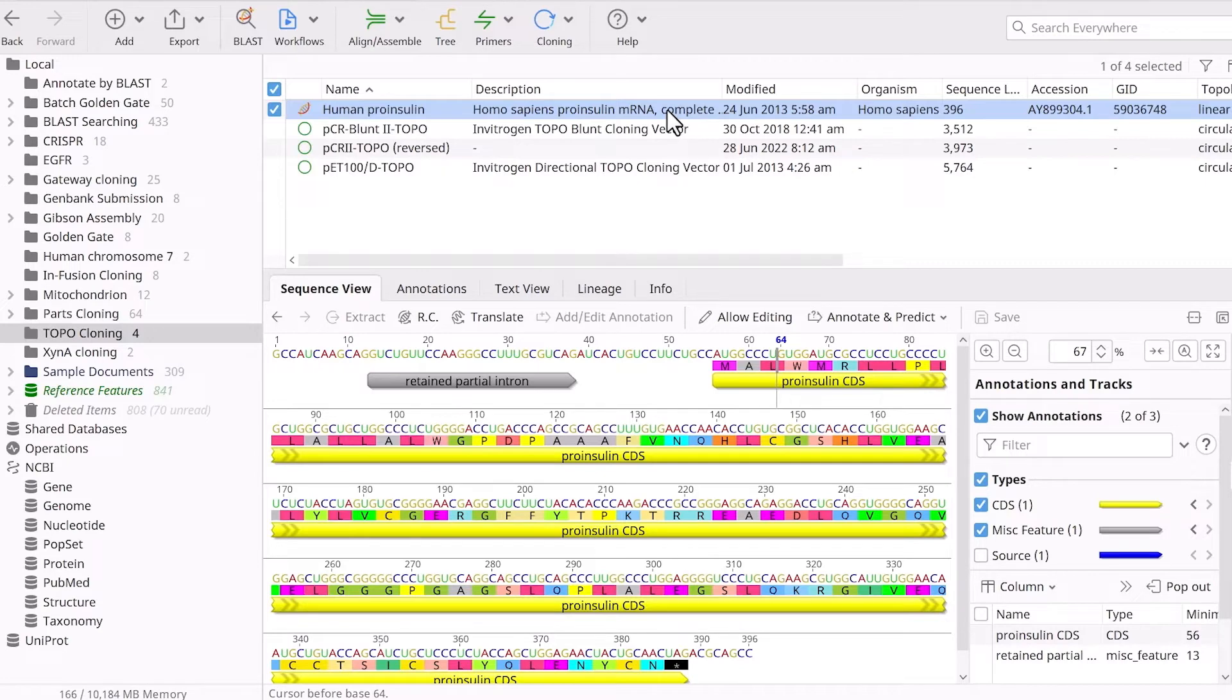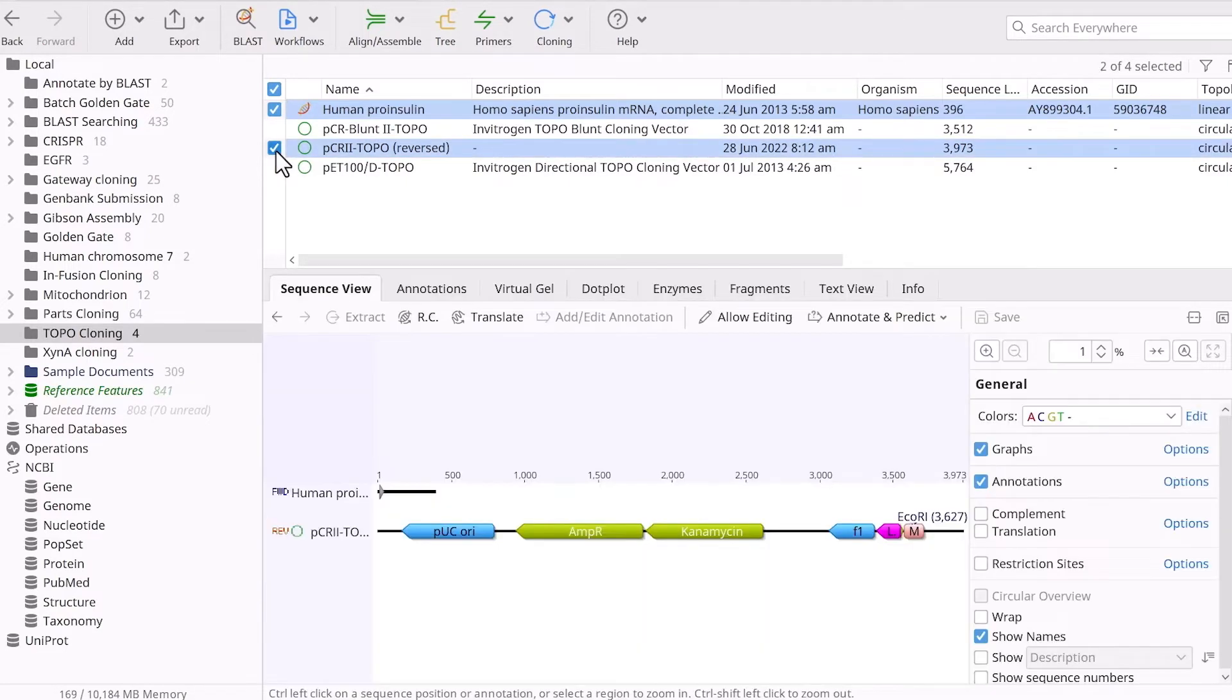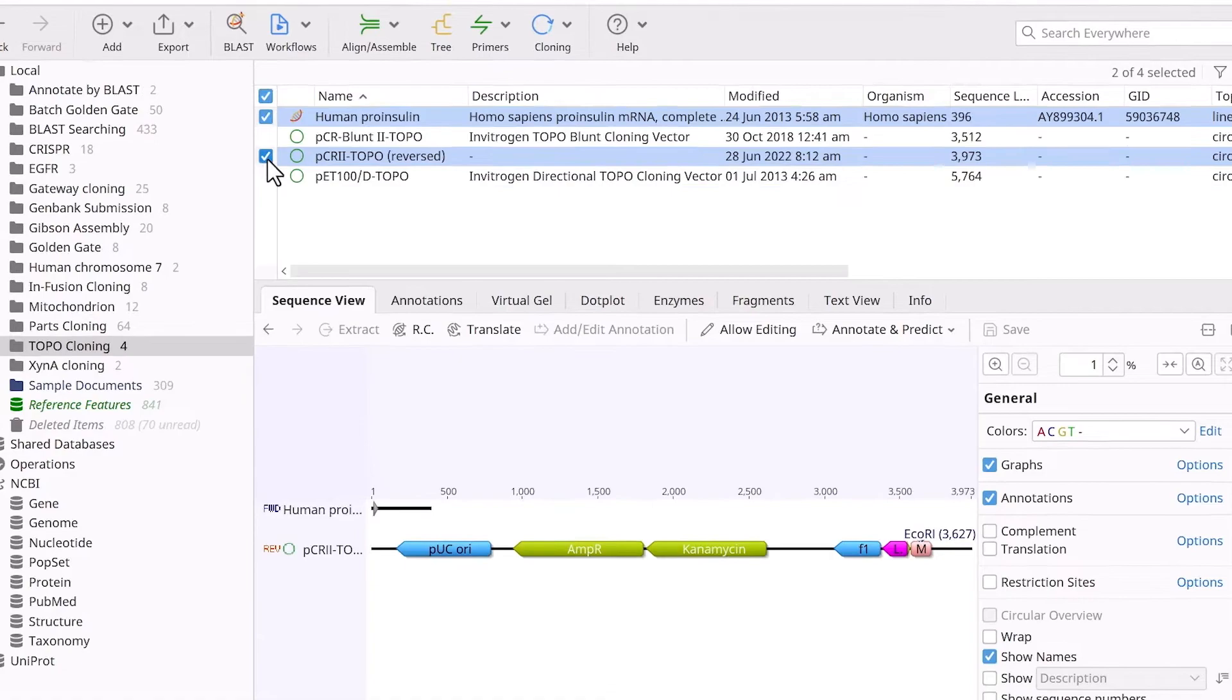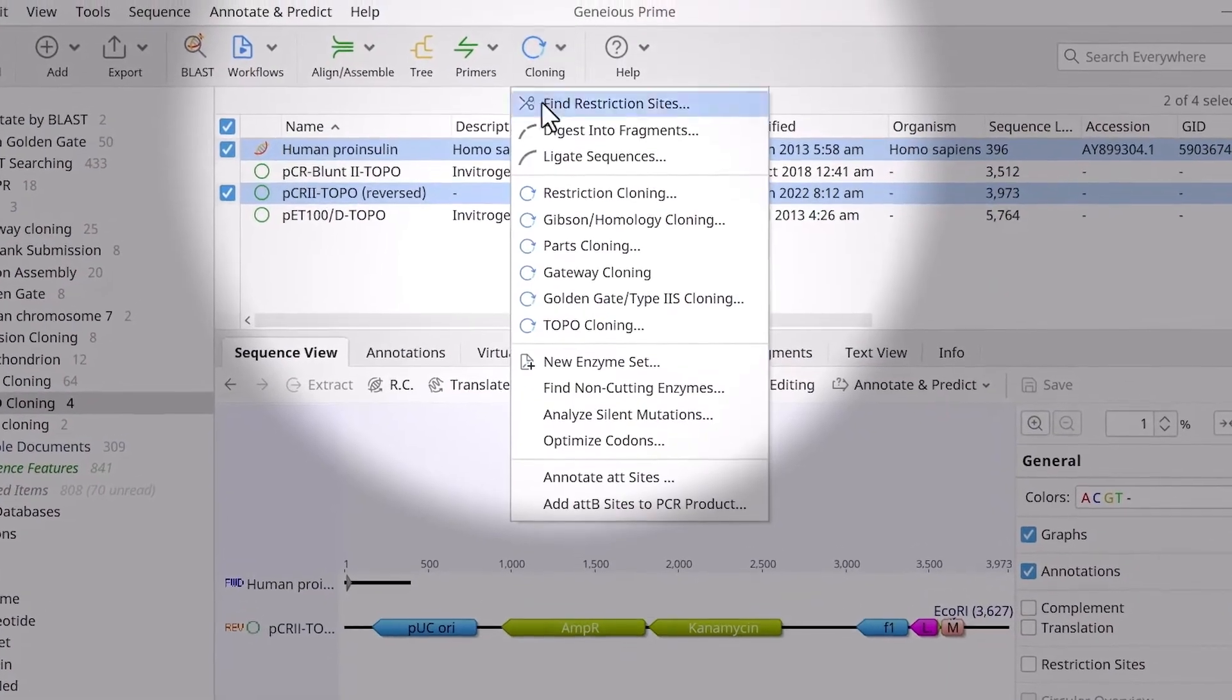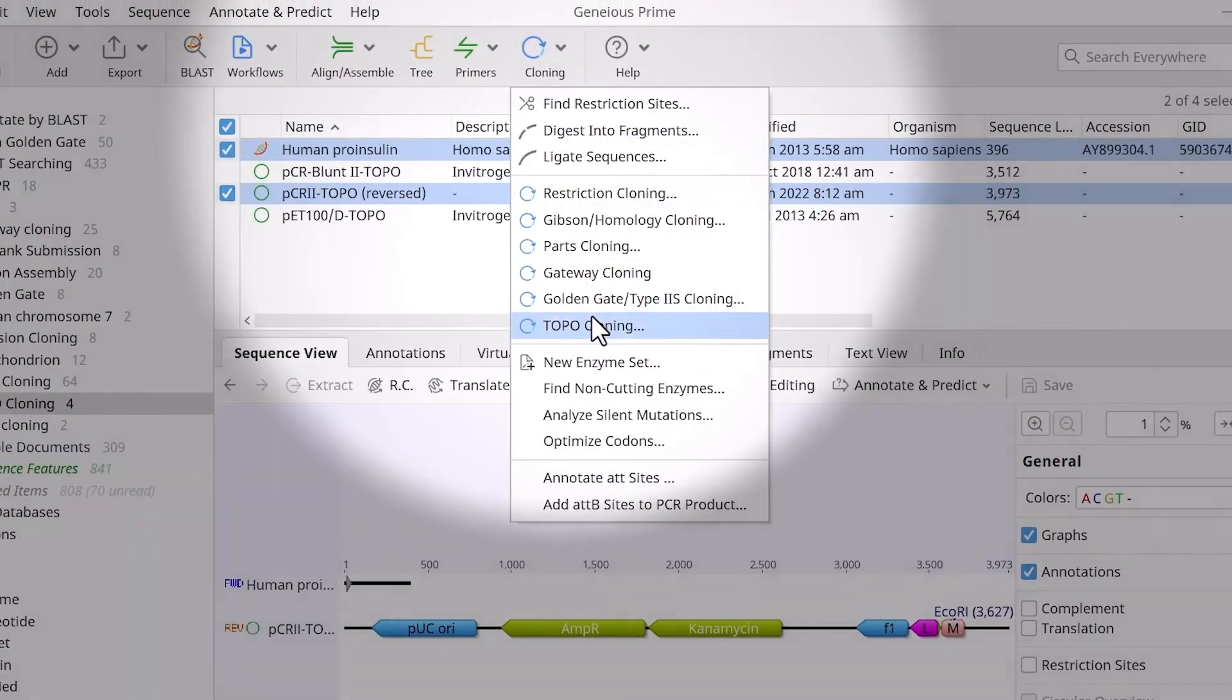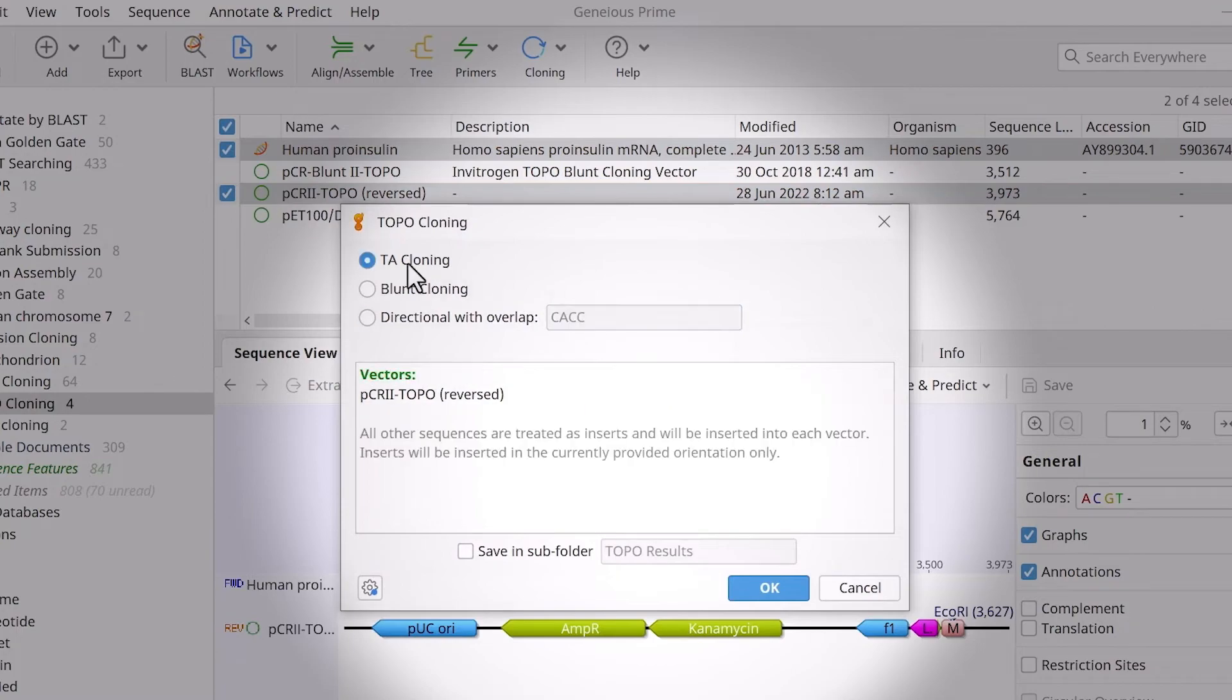With the vector and insert files prepared, you are ready to simulate the Topo TA cloning reaction. Select both the vector and insert sequence files, then go to Cloning and choose Topo Cloning. In the new window, ensure TA cloning is selected and click OK.